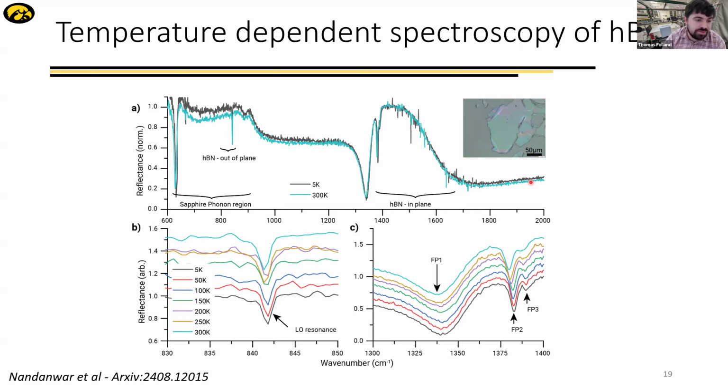And so just to give the example spectrum we take, this is boron nitride exfoliated onto sapphire substrates from single crystals from Jim Edgar's group that are isotopically pure. If you take a thick crystal, you can see this Reststrahlen band region where the flake is highly reflective. We also see a lot of features just from the sapphire substrate that's underneath. And the first thing you note is that, certainly in terms of the frequency of these modes, there's not a lot of tuning there, but they do change energy as a function of temperature.